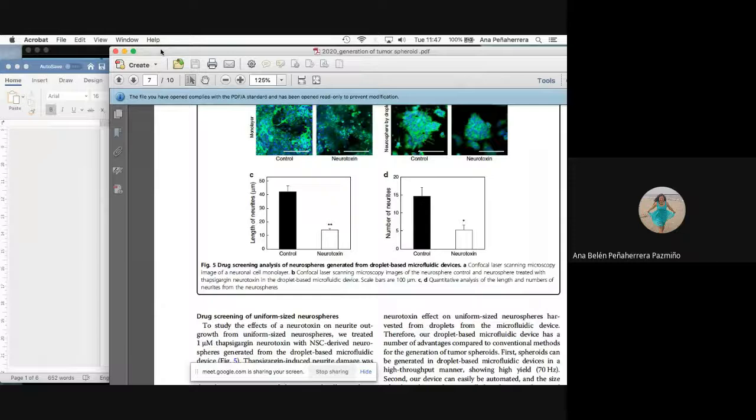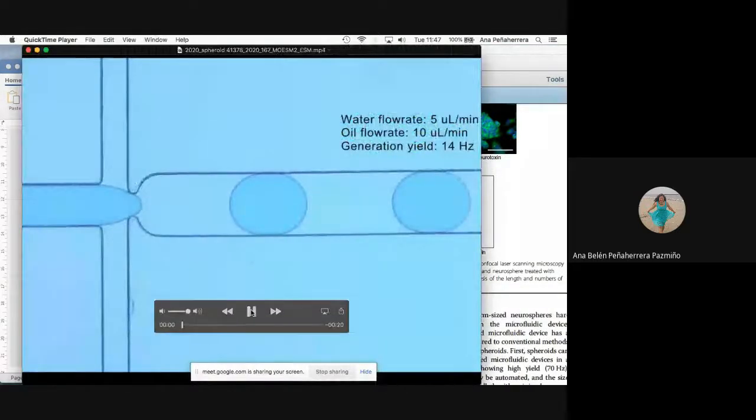Finally, I would like to show you just this video that they share in the supplementary information, how they control the size of the droplets by changing the oil flow rate, and they measure the frequency.